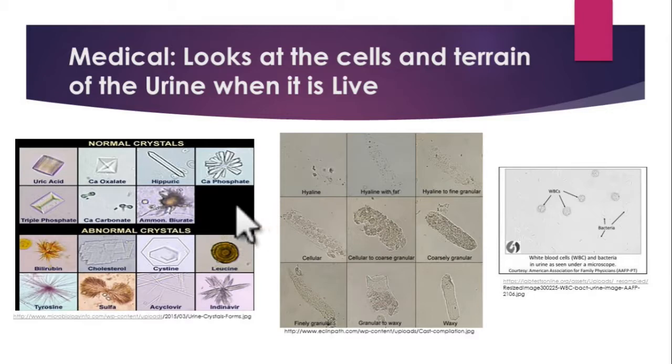It looks at crystals, abnormal or normal crystals. It looks at aggregates of cellular forms or hyaline forms, and it may even be able to see bacteria. So all these things might be good indicators of a pathological condition.